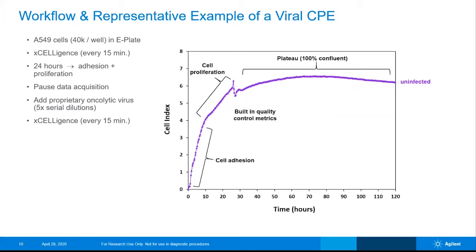The Nobel laureate Arthur Kornberg was famous for having stated in his 10 Commandments of Enzymology, he said, "Do not waste clean thinking on dirty enzymes." And the idea here is obviously that if you're using a dirty enzyme prep, it sends you down all kinds of rabbit trails that lead to spurious conclusions. And we've seen over and over again, the exact same thing is true in a cell-based assay.